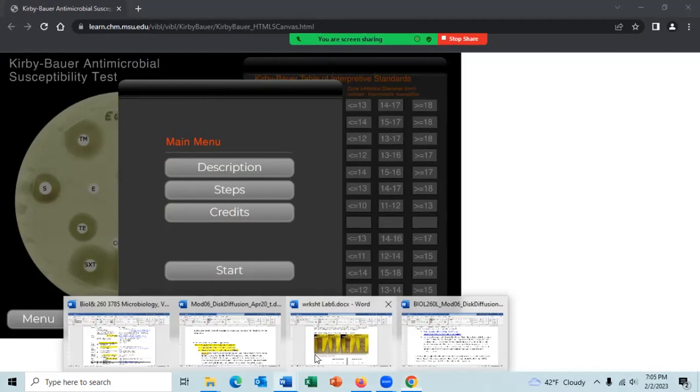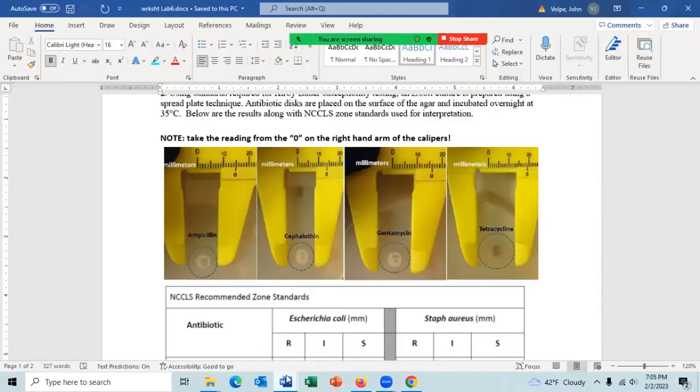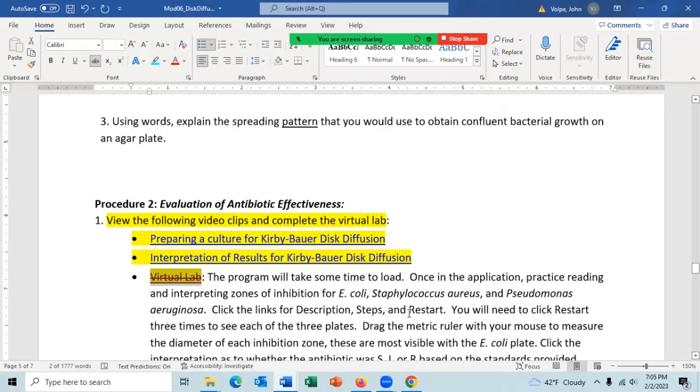Where is it? Here it is. Nope, that's the worksheet. And then we have a little video for interpreting the results of the Kirby-Bauer disc diffusion test. So watch both of these videos.